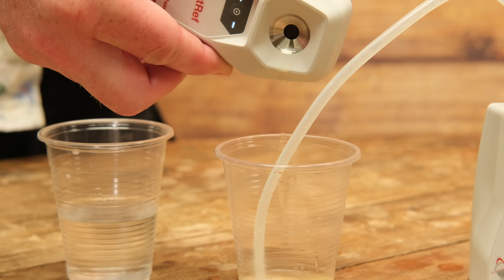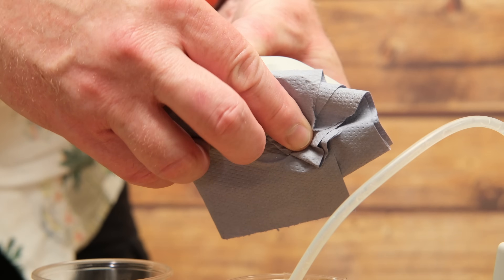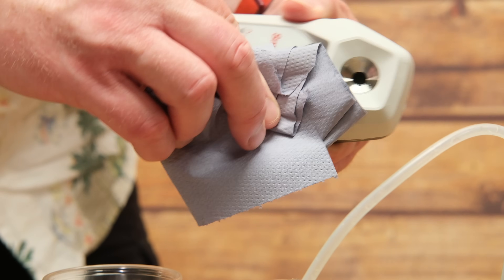SmartRef is even easier to clean because nothing actually enters inside of SmartRef — all you need to do is pour the little sample out, give it a little rinse with some water, shake off the excess, dry it off with a towel, turn it off, store it — job done. It's worth noting that we also have the silicon rubber sleeves for the SmartRef as well, so you can wrap that and keep it protected, just like you do with the EasyDens.